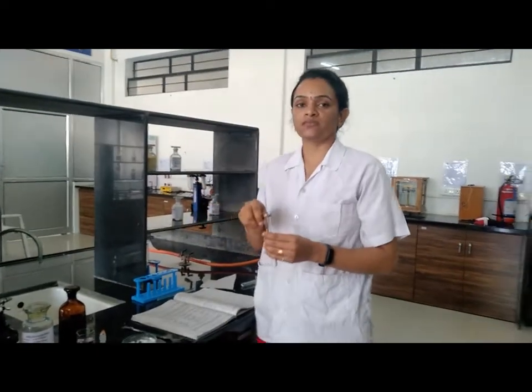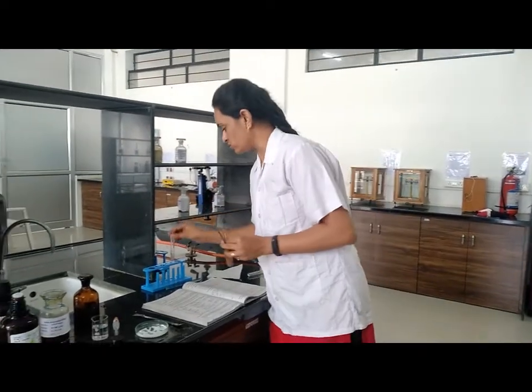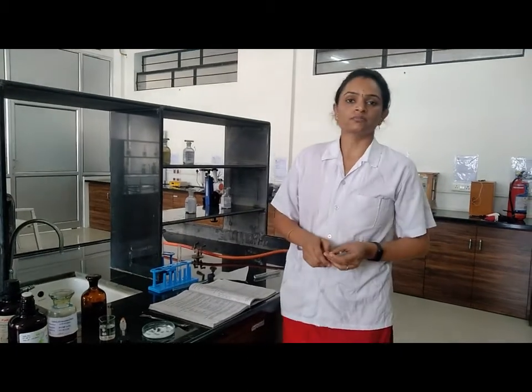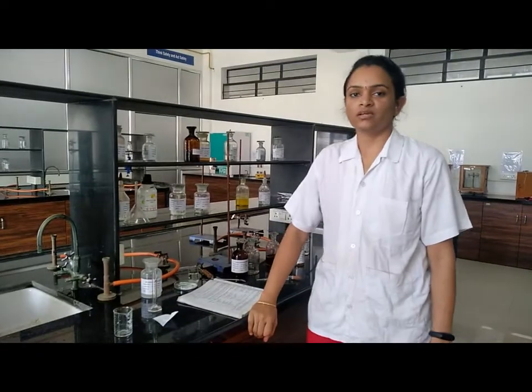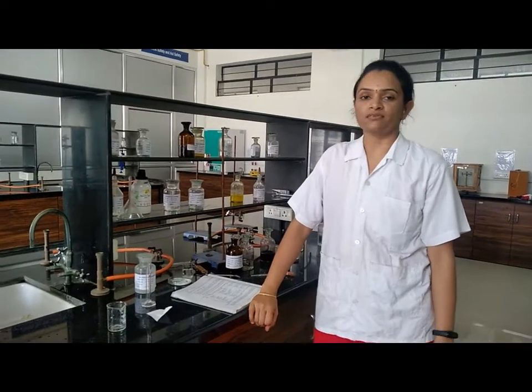These four different solvent we are using for performing the solubility, that is water, alcohol, ether and chloroform. Now we are going to start with identification test.